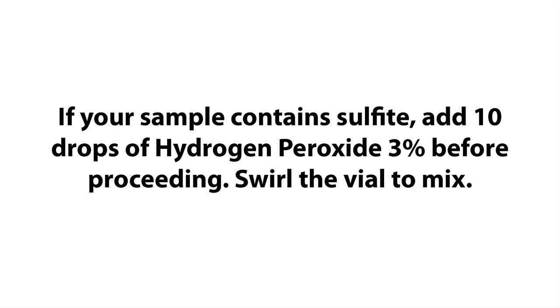If your sample contains sulfite, add 10 drops of hydrogen peroxide 3% before proceeding. Swirl the vial to mix.